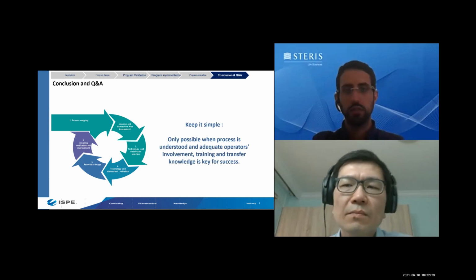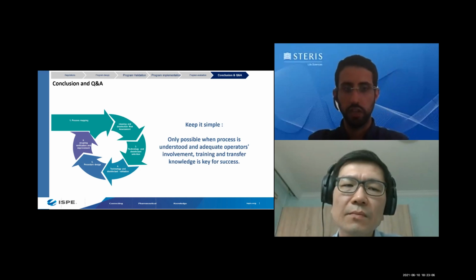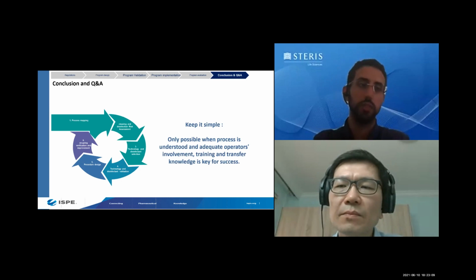Why? Because the wet contact time of a disinfecting agent, especially a sporicide or a disinfectant, will be multiplied by even 4 or 5 times. So you have to demonstrate, either through a coupon study at the cold room temperature that you are working at, what the adequate wet contact time is. Or, if the excursion is not very important or very recurrent, there is a possibility of using a detergent to remove the mold and then using a sporicide to make sure you have a kill, and make sure you wait the adequate wet contact time.